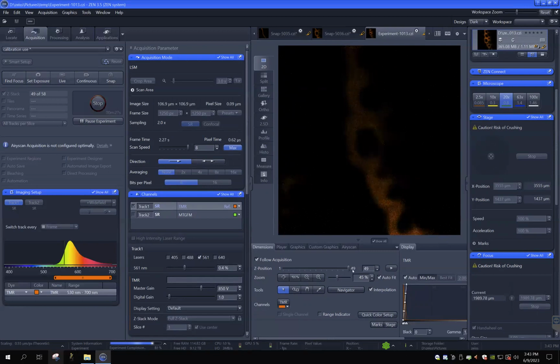Okay, this is almost done. We're right now at the 50 layers. A couple more seconds and we'll see the result.